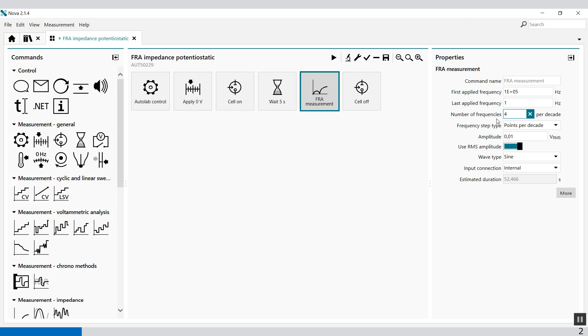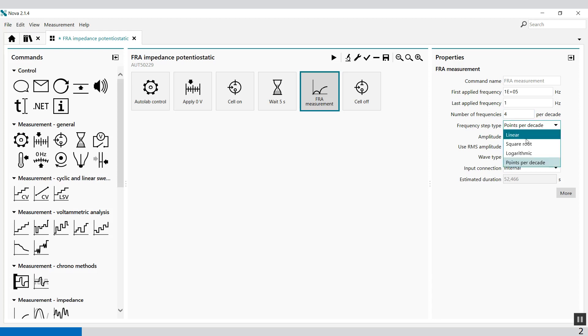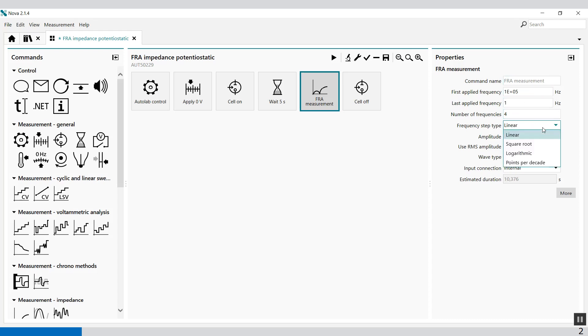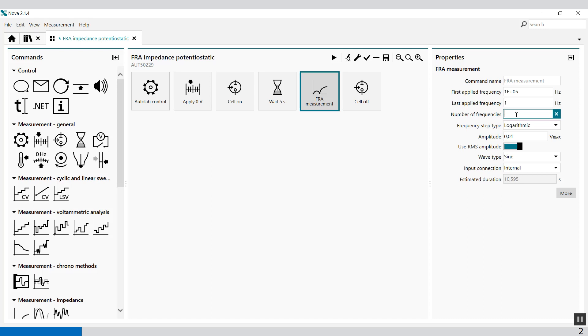The number of frequencies per decade used in the frequency scan depends on the frequency step type property. The frequency step type property is now set to points per decade, but you can also select a linear distribution between 100,000 Hz and 1 Hz or a logarithmic distribution between 100,000 Hz and 1 Hz, and you can select how many frequencies you want to have in between.